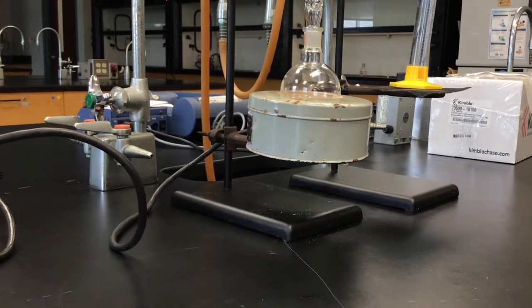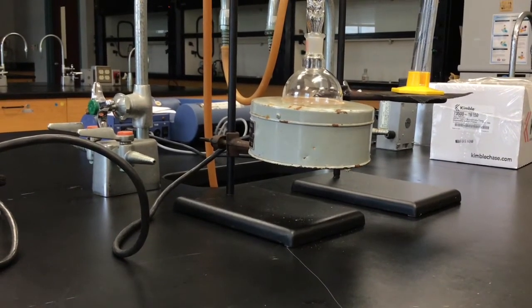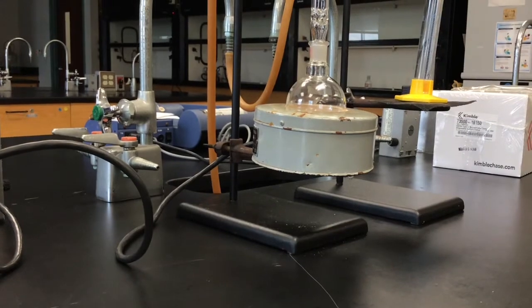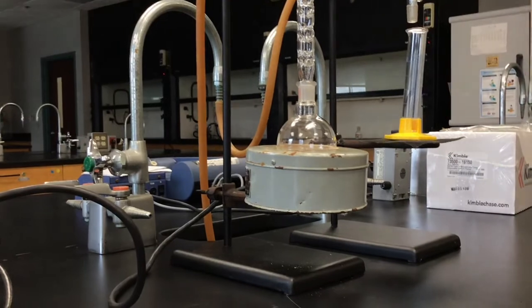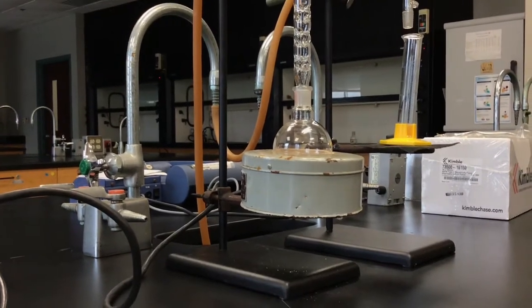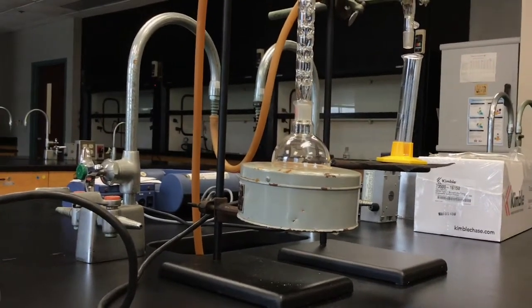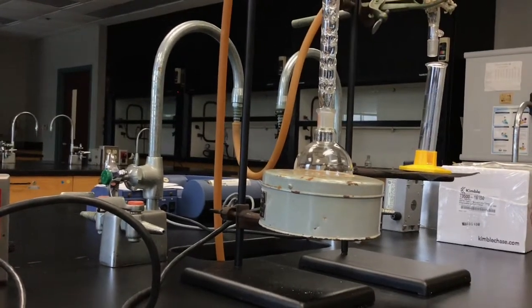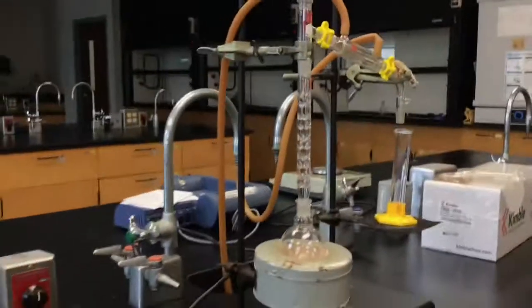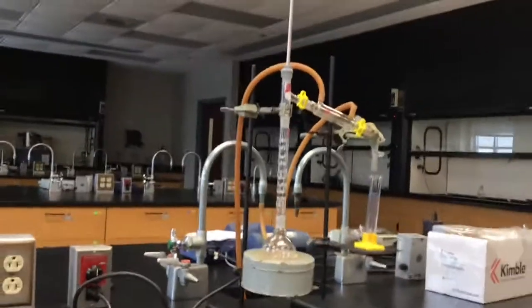Additionally, if it gets too hot or it flares up and you need to take the temperature away quickly, you can undo the screw back here and drop the whole thing off, leaving the pot behind and it shouldn't continue over boiling because you dropped the system off and you're not supplying heat anymore. So that's why this is elevated. And the same thing is the standard for a simple distillation because you need to create good separation.